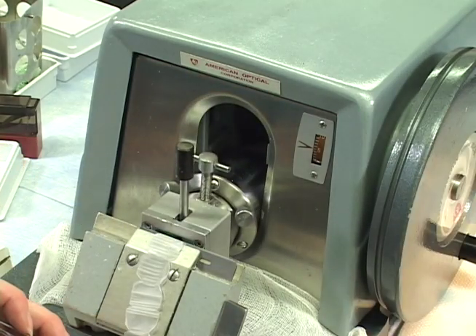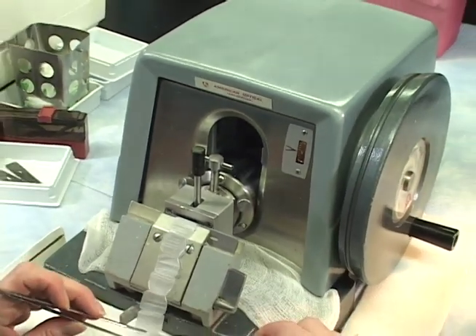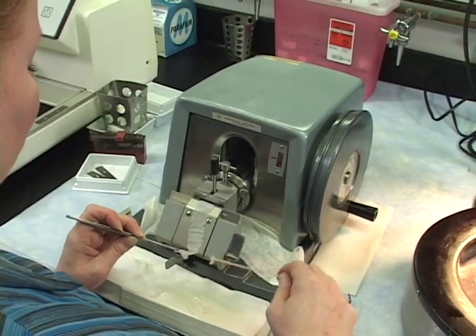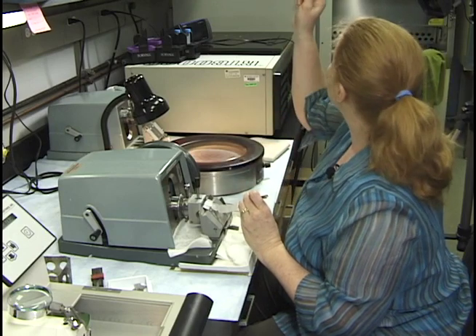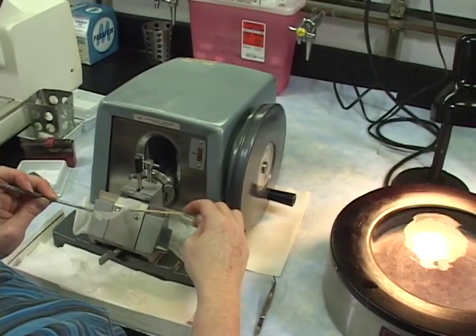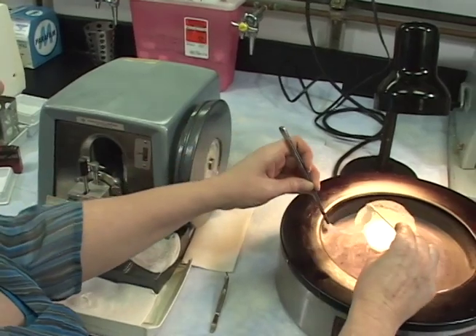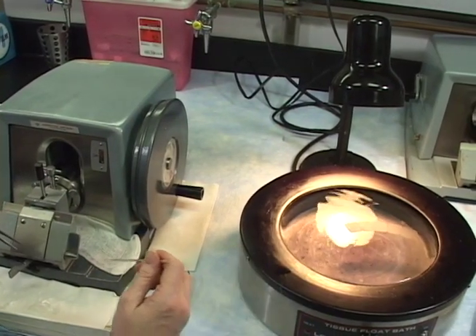And then what you do with that ribbon is, I like to use a stick. So I hold on with the forceps. We got a little bit of a breeze in this particular room, so you really want to have full control over the ribbon. So you've got a breeze from the vents coming through. I moisten the stick just a little bit, and then I come up under it and I hold on to the ribbon and I bring it over to the water bath. And we get a nice ribbon of the tissue.